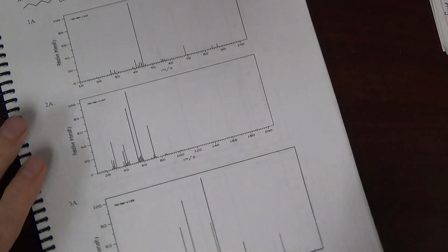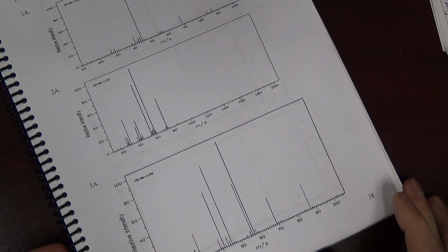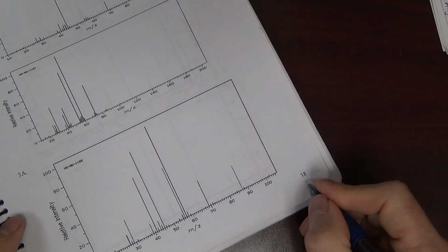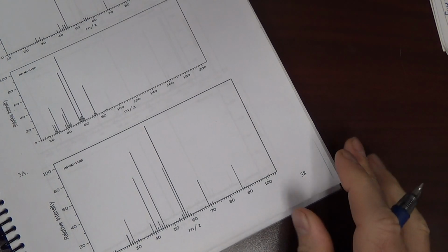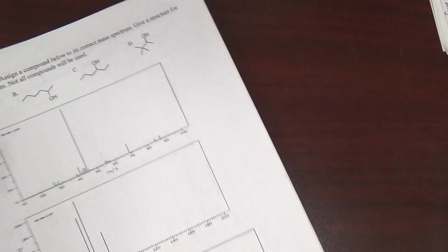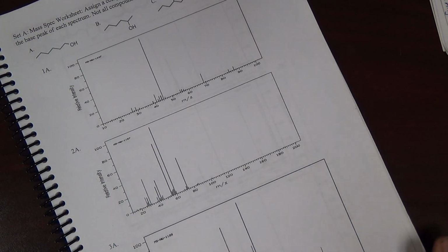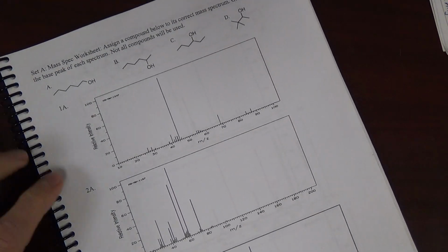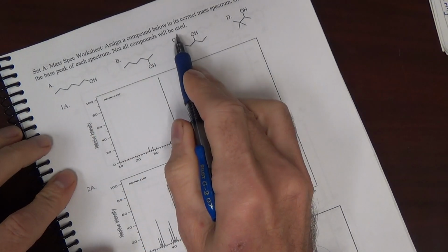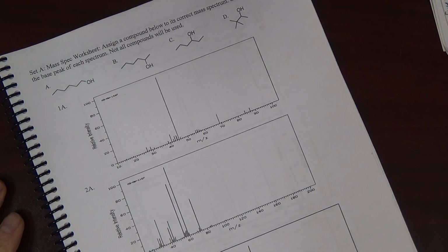In this video, I'd also like to look at one of the worksheets in the workbook, page 38 here, which is the first problem set. Let's do these. So we have 4 compounds and 3 spectra. Not all compounds will be used. So which compound goes with the top spectrum?